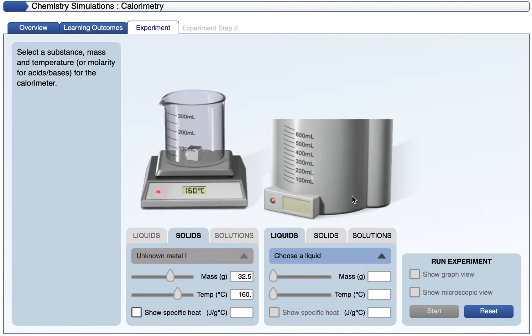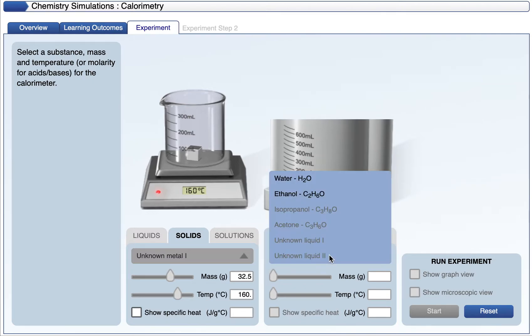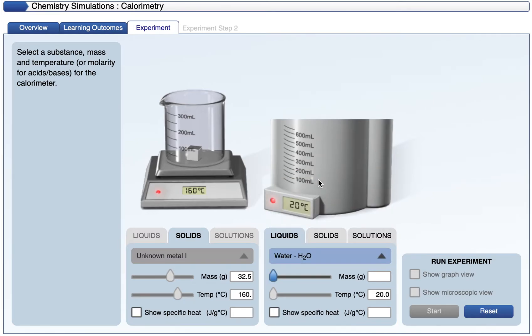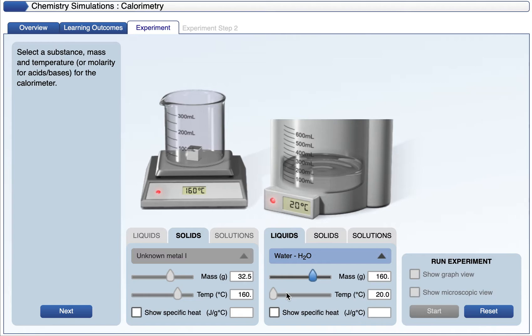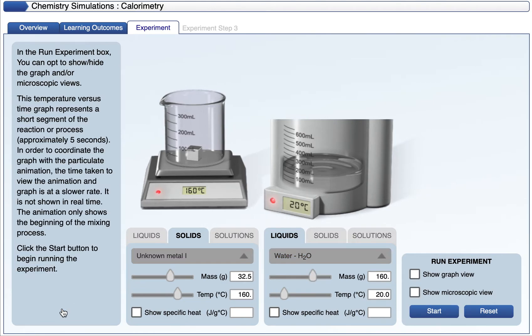In the calorimeter, I can have different substances. I actually want to have a liquid, and specifically I want to have water. I can adjust the amount of water that I have in that container. I'm going to put it at 160 grams. The temperature of the water is not adjustable, so it's going to just be 20 degrees Celsius. I can go ahead and hit next, and then I can run the experiment.